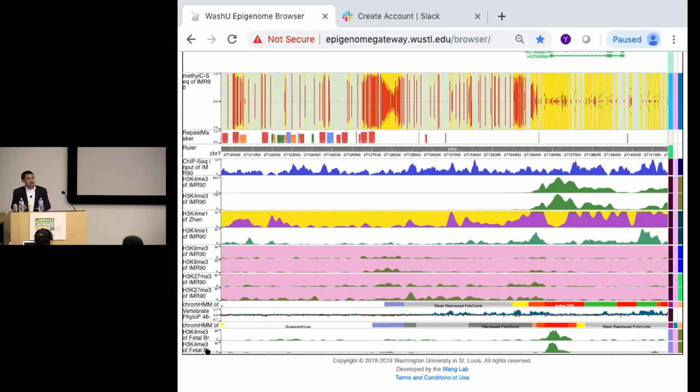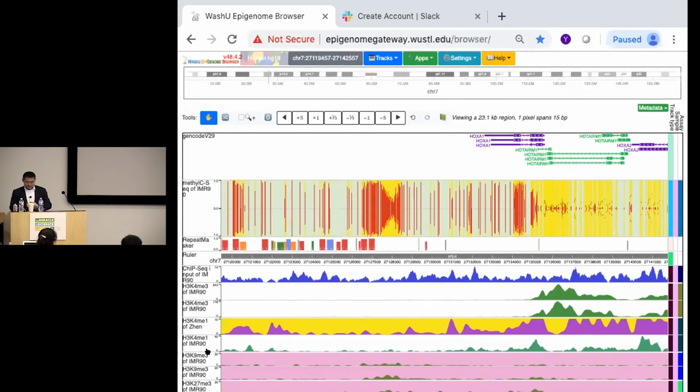And you want to show this to your colleague, friends, PI, your daughter, if they're interested in. So you want to keep a record. You want to save this. So that's when the session function becomes useful. Okay. So that's what I'm going to demonstrate next.